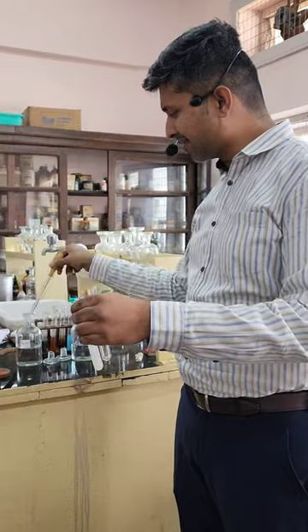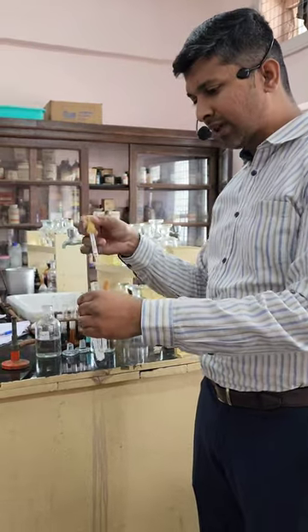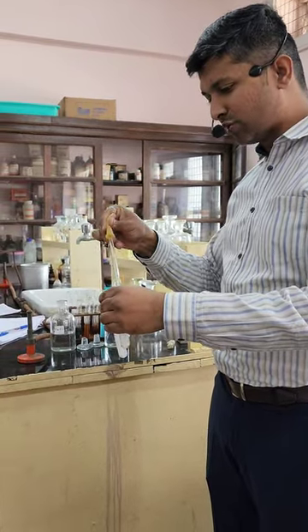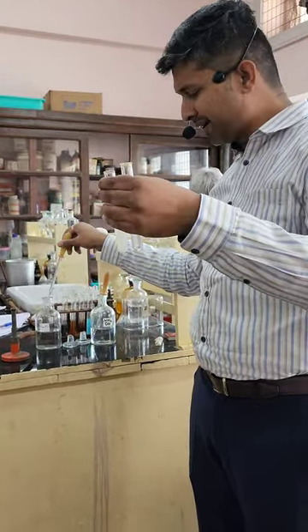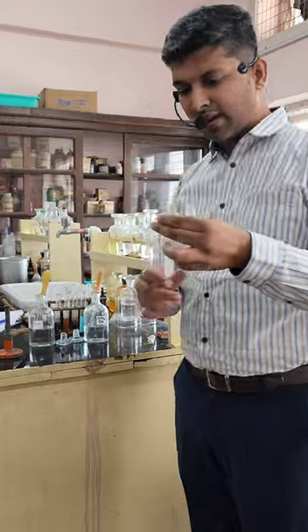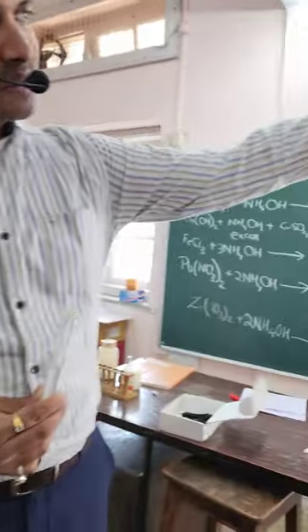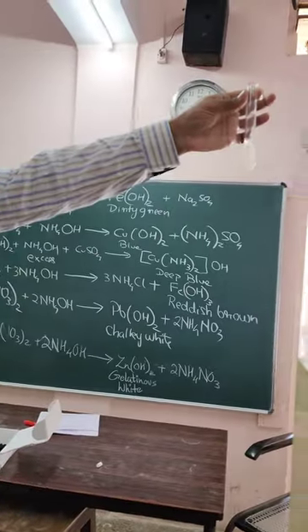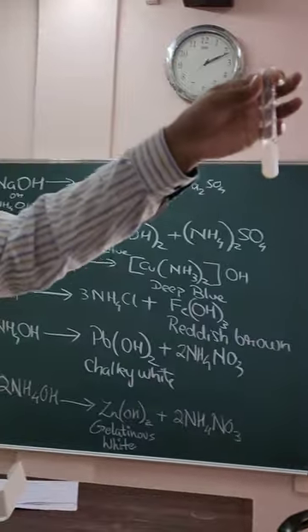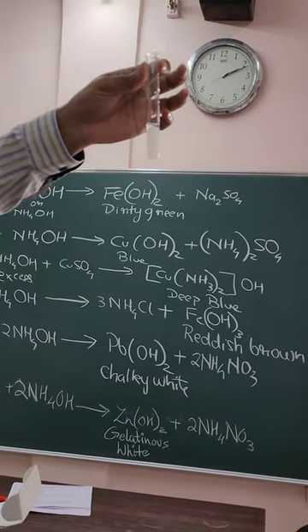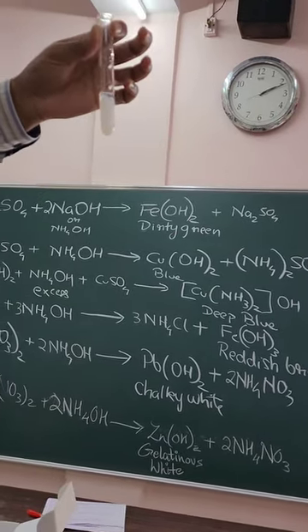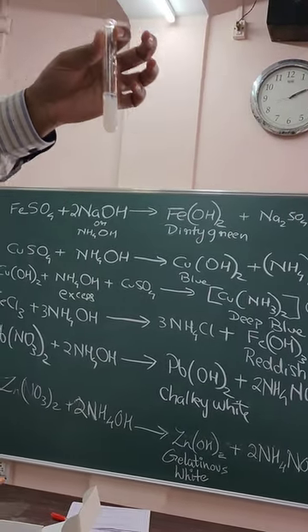In both the cases, you will get the same PPT, of course. And the PPT should be gelatinous white. Now, if you look at this PPT, you can see it is a little transparent. It is not chalky white. Where is the chalky white? Here.